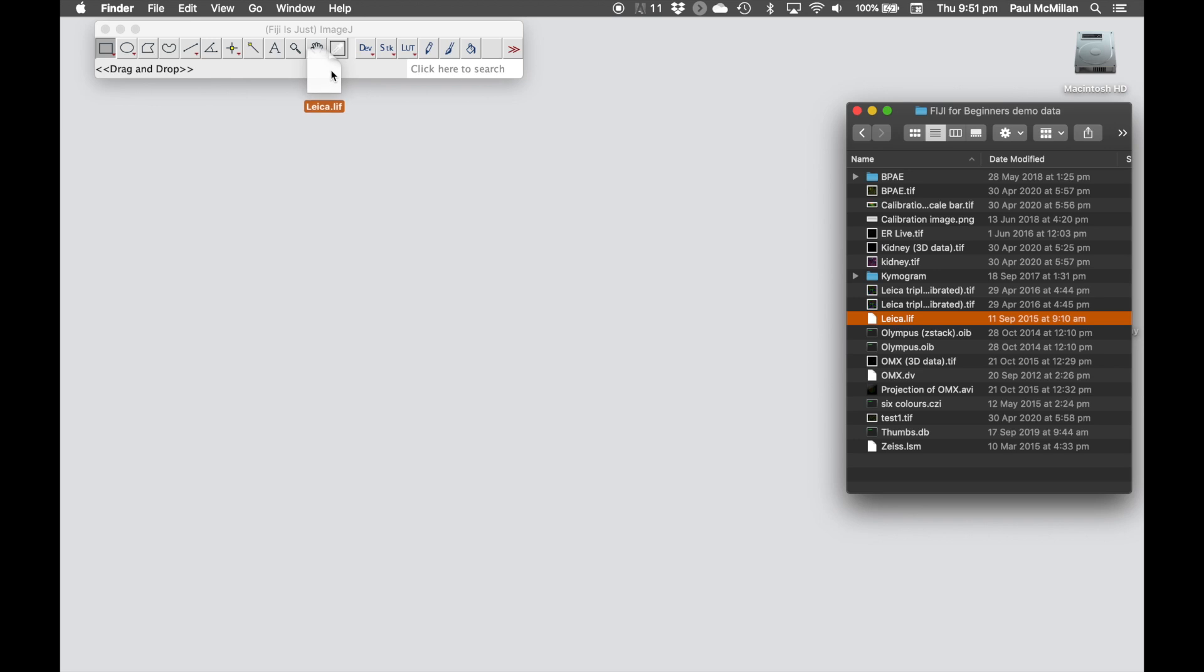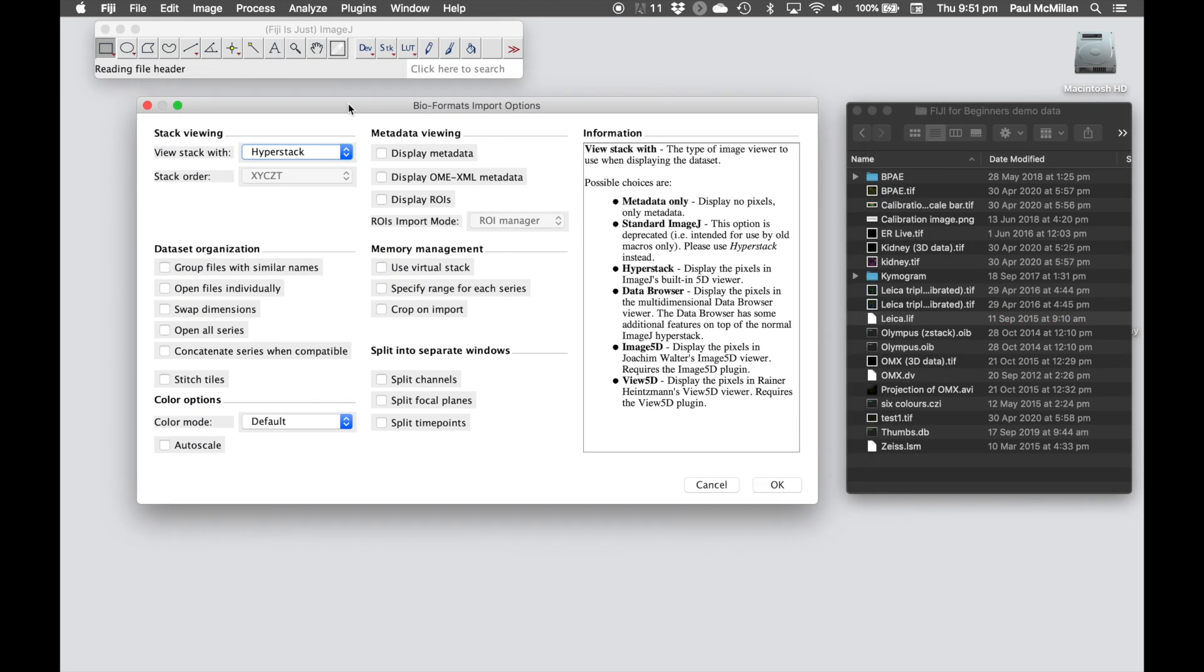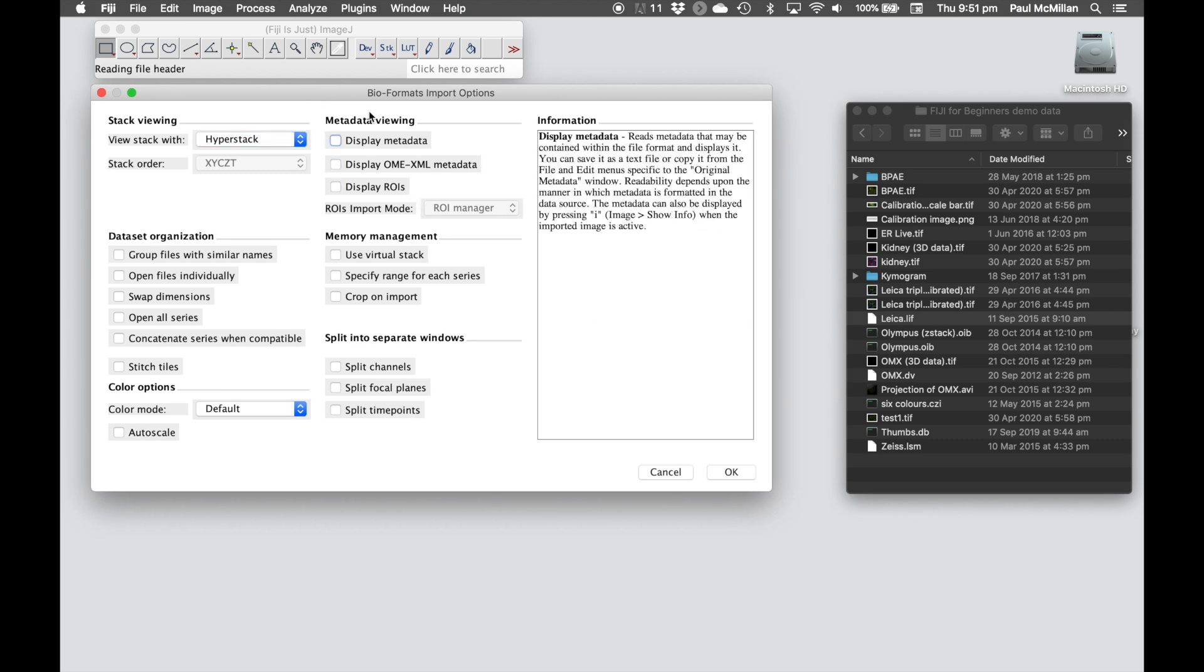We can again drag and drop this, but now it brings up this dialog box. This is what we call the Bio-Formats import options. This is Fiji using something called Bio-Formats to read the Leica file extension and be able to open that. Bio-Formats work out a way of being able to open up all the different companies' file formats and open that up within Fiji or some of the other software as well. This gives us a lot of different options in terms of how we want to open up these images.